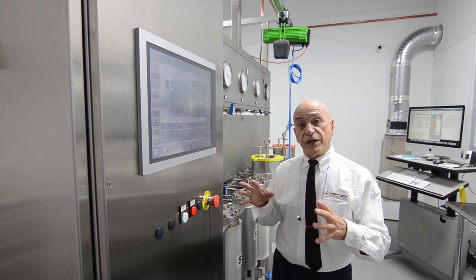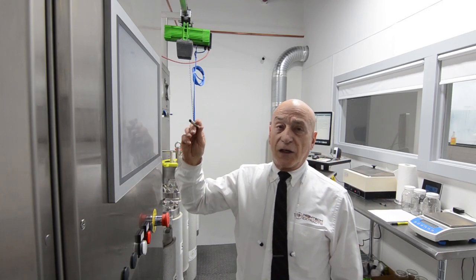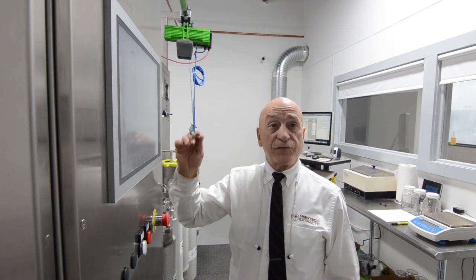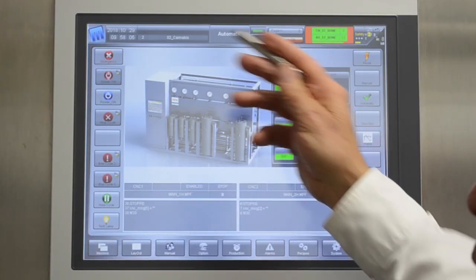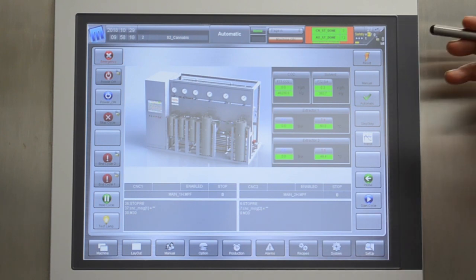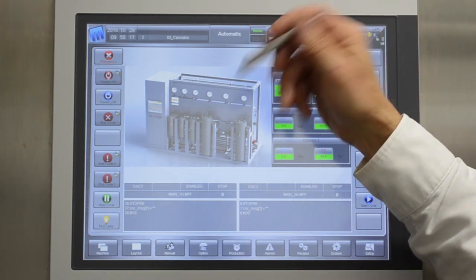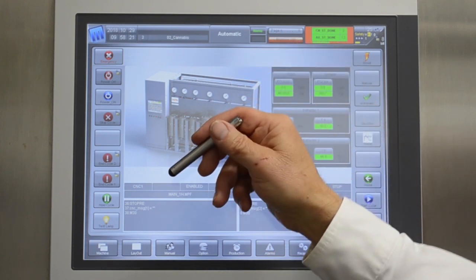It's helpful to have an understanding overall of the control system. The touchscreen display is what controls the system. It has a number of different pages with different functions. The machine page, which we're looking at right now, gives you a general overview of the machine. It's what you use to put it into manual or automatic mode, to power it on, power it off, do emergency stops, etc.